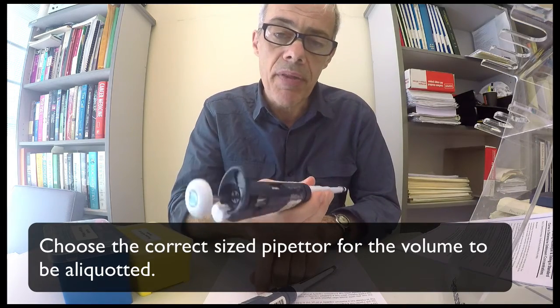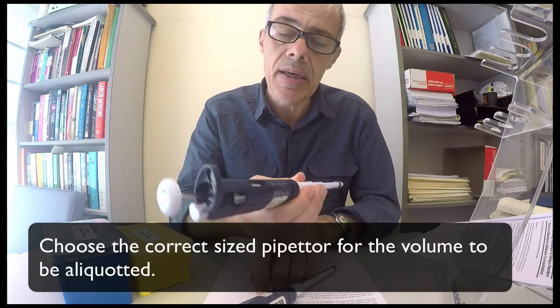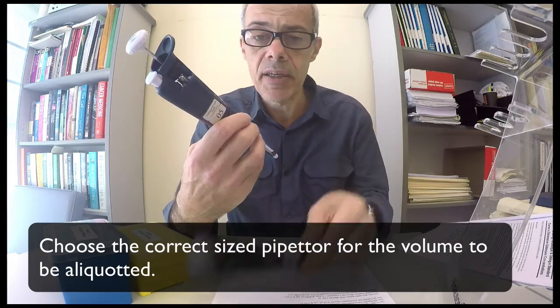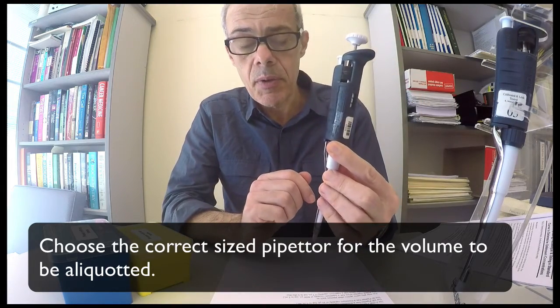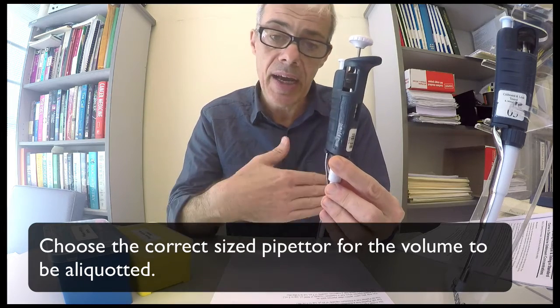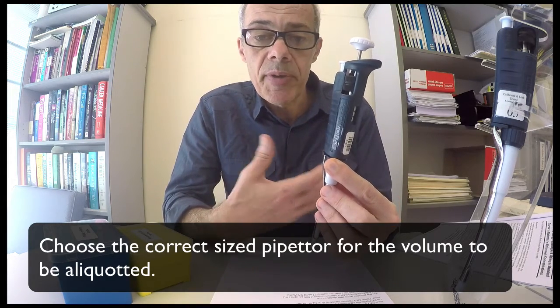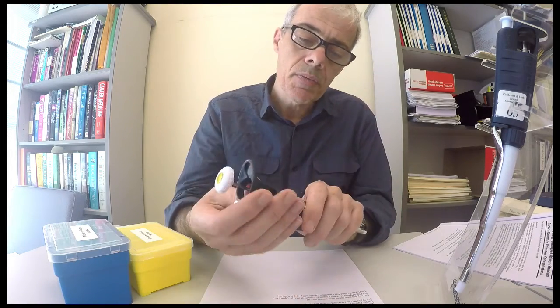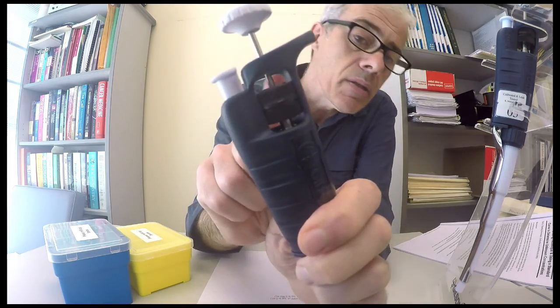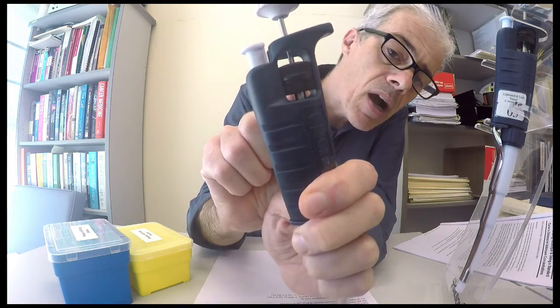If I were to dispense 180 microlitres I would use the P200. I would not use the P1000 to dispense anything that's in the range of this pipette, because this is designed to pipette between 200 and maybe 20 microlitres, maybe 10 if you're desperate. So if I want to dispense 180 microlitres I can see here from the wheel that it's about halfway.